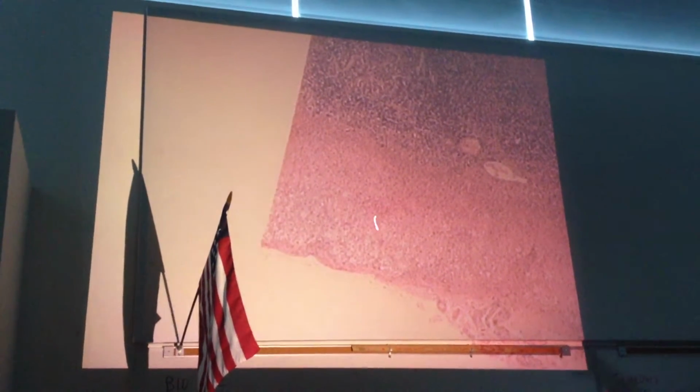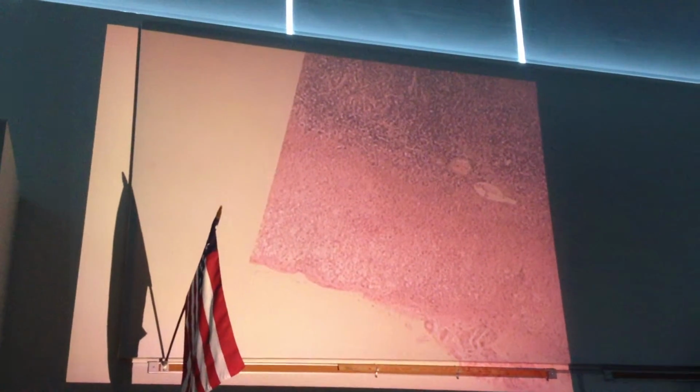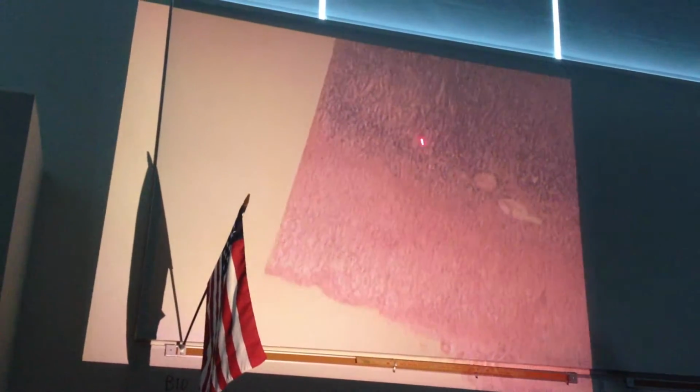And the adrenal cortex makes a specific type of hormone, and that we'll talk about when we talk about the adrenal gland. It's actually made up of 3 regions, but we can't distinguish the regions. Well, we could, but we're not going to try to distinguish the regions. That's the cortex. Cortex means bark. Bark is on the outside of a tree, so the cortex is on the outside of the adrenal gland. Look where it's very, very dark here. And that's the medulla, that's the core of the gland. It makes 2 different kinds of hormones there.